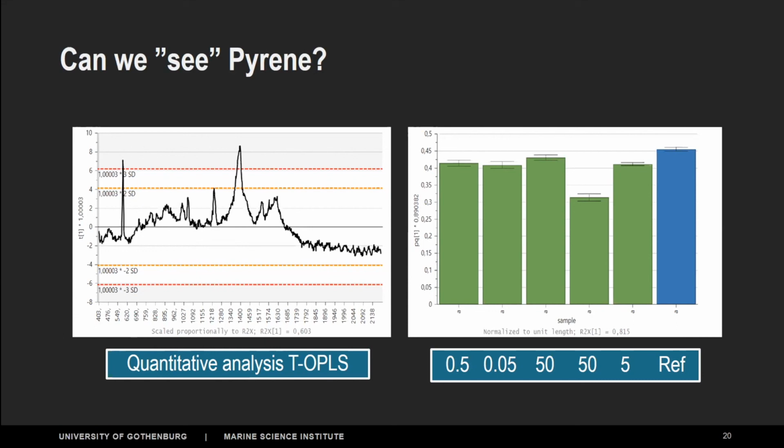And then you compare the components, and this is the leftovers in the small concentration, and you see that we get the peaks, or we should have the peaks of pyrene. So statistically, we can see that we have pyrene at 10 micrograms per liter. Even with the naked eye in the spectrum, you don't see it. By applying these models, you actually see it is there.